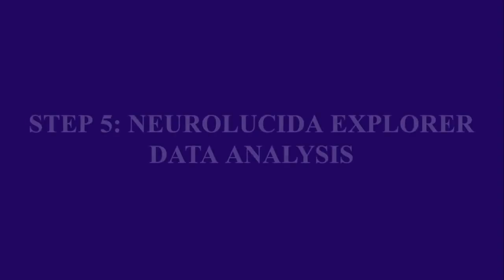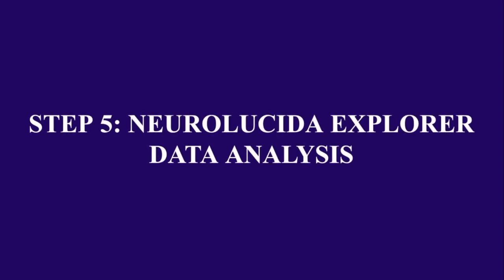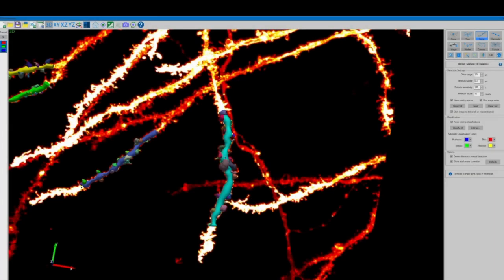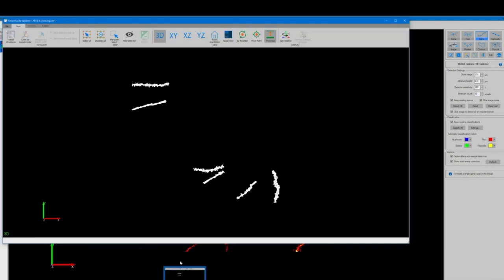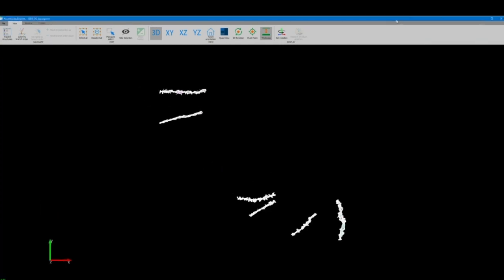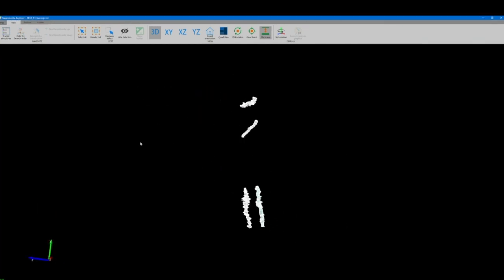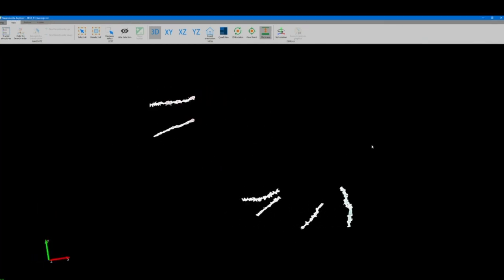For our final step we'll export all of our data to Neurolucida explorer for analysis. In the top left corner of our screen along the 3D environment toolbar the button with the n that says save and view in Neurolucida explorer will automatically open another window on our desktop with all of our data exported and ready for analysis.